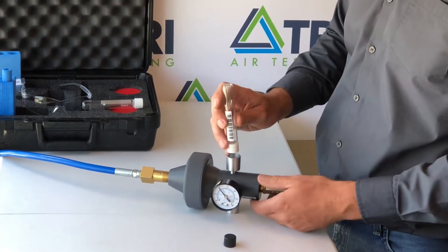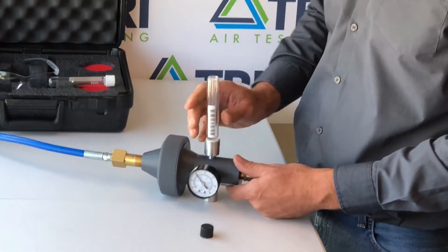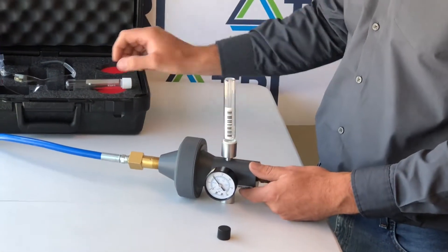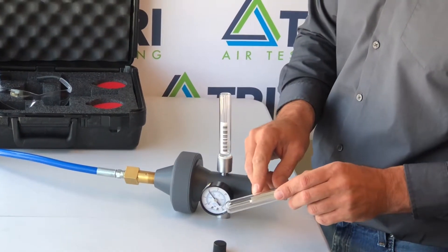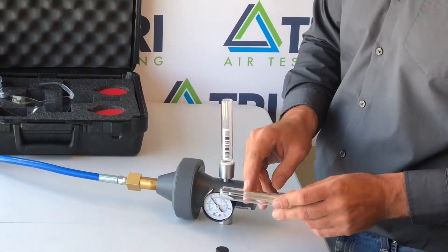Insert the bottle by pushing straight down into the bottle fitting. Flow will be indicated by a white float in the inner tube.